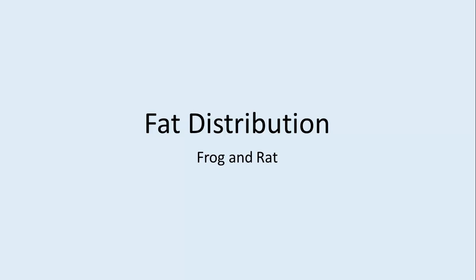In this presentation, I'm going to talk to you about the fat distribution in a frog and a rat. The frog being an example of an amphibian and the rat being an example of a mammal.